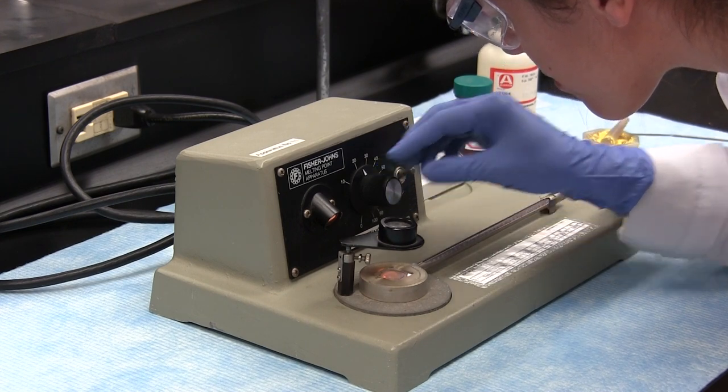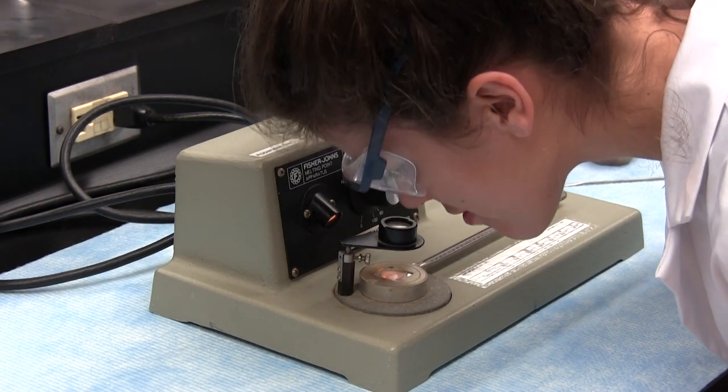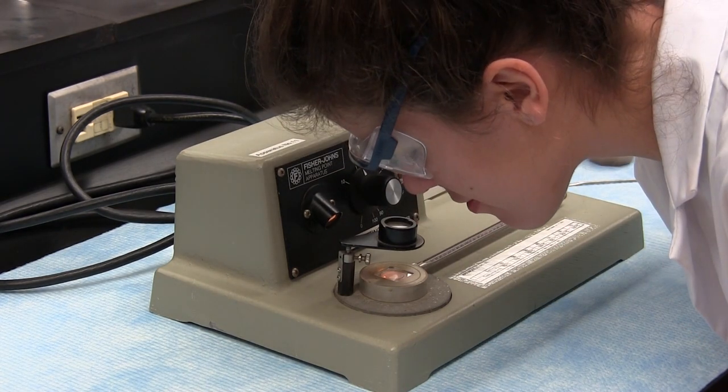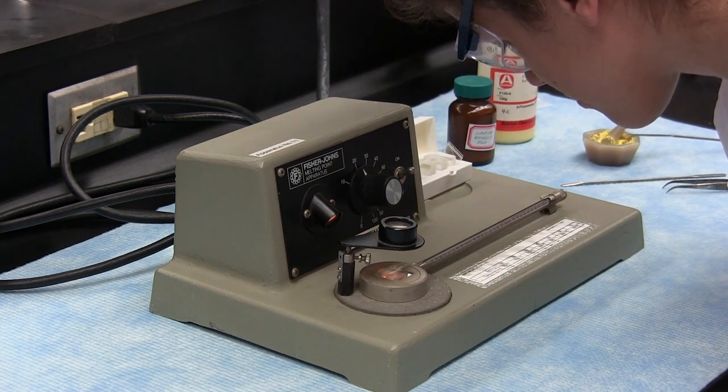The adjustment is made, and the rate of heating is monitored. Use your judgment with some further minor adjustment if needed to maintain a temperature gradient of no more than 2 degrees a minute.